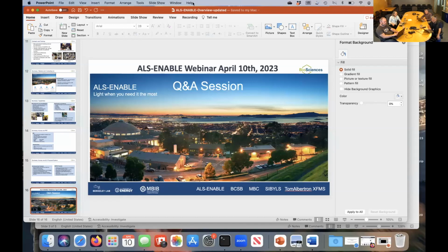So I can add that for the BCSB detector right now, we are attempting to get the dev.site file for all the detectors that we have, so that at least you could get a first start in using HKL if you want to do so. Yeah, that's a good point. Most of us do have dev.site files that we can give you for our detectors, if you have HKL 2000 and would like to process it yourself at home.